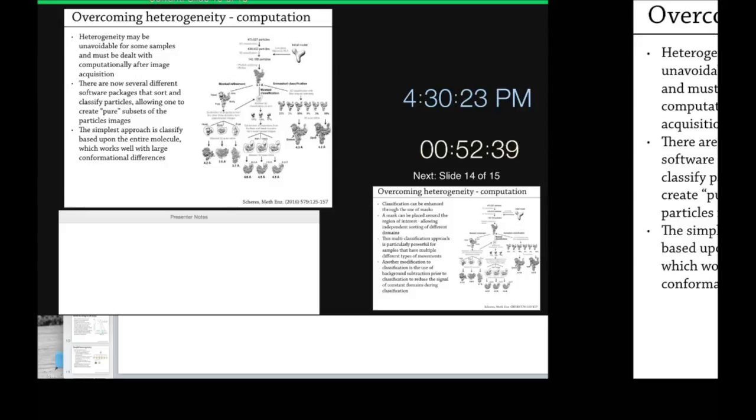But it's always a good idea that when you do 3D classification and you lose more than half of your data, try to think about why that data is getting thrown away. What about it is not positively contributing to your reconstruction? What about it is different than the particles that you want to look at? And then at the end, if you make a biological conclusion based on 0.4% of your data, how meaningful is that? How representative of that is of the full data set? These are things that are starting to be addressed in cryo-EM papers, but it's still something that you always need to think about when you're going through your algorithm.